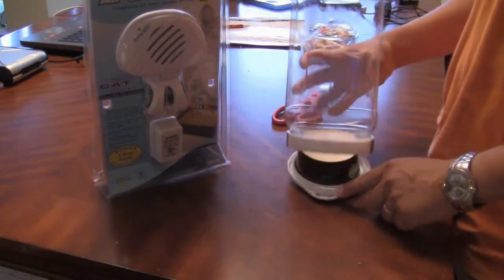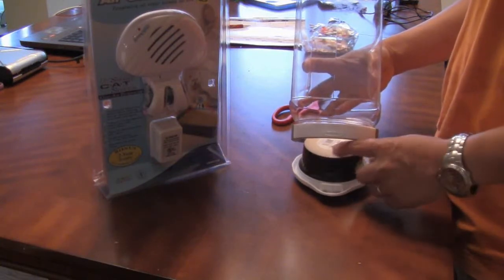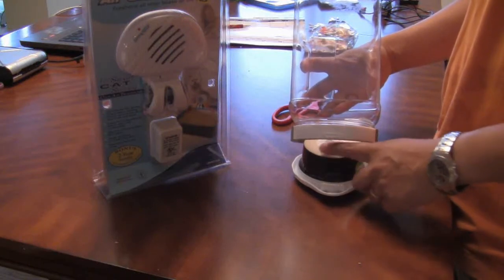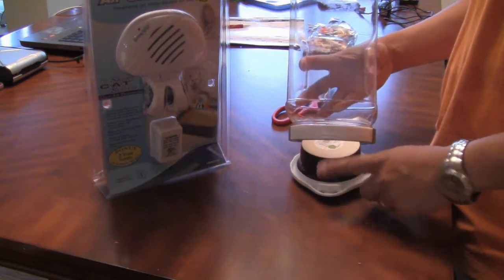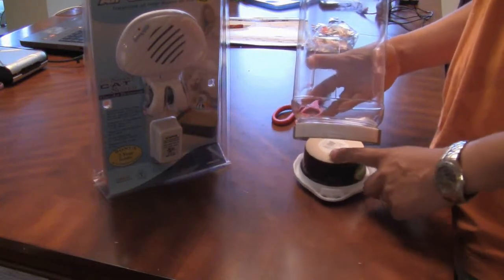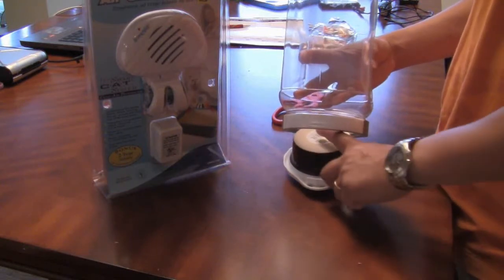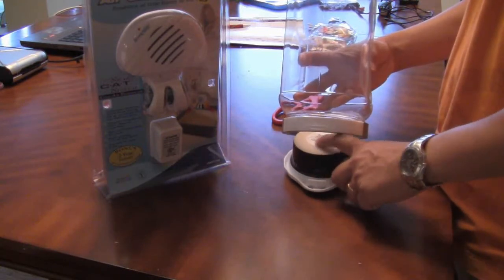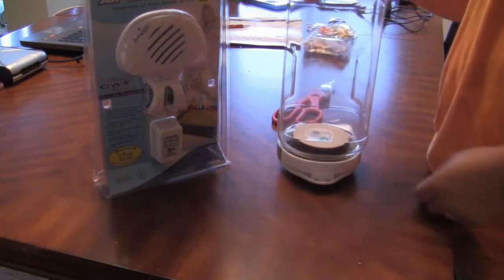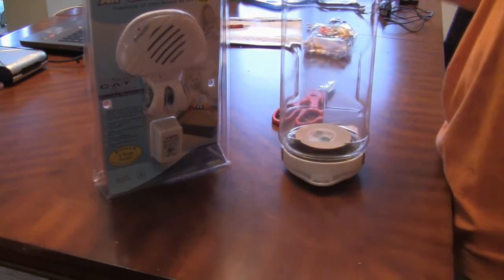The reaction will occur in the ceramic container, not the plastic one, because if there's a chemical reaction that generates a lot of heat and fire, you want to contain it in something that can handle high temperatures. So the ceramic serves as the reaction surface. You put the chemical reaction powder in here, then close it up.